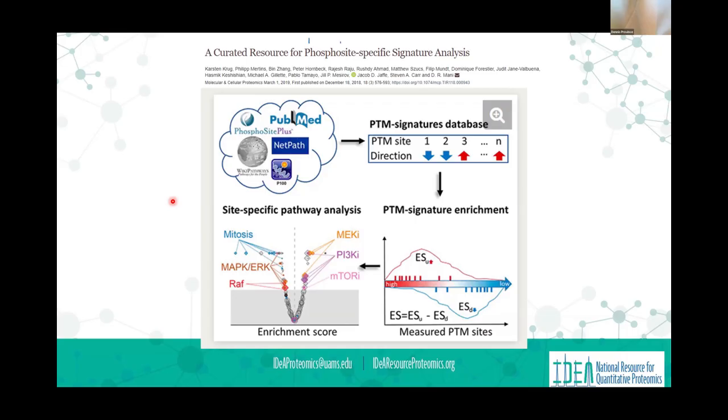There's a lot more crosstalk across phosphorylation than what we realize. If you knock down a kinase and do a phospho experiment, you're going to see changes, and you're going to see some phosphorylation down, but you're going to see a compensatory reaction, and you're going to see other phosphorylation up. That network is just extremely complicated.